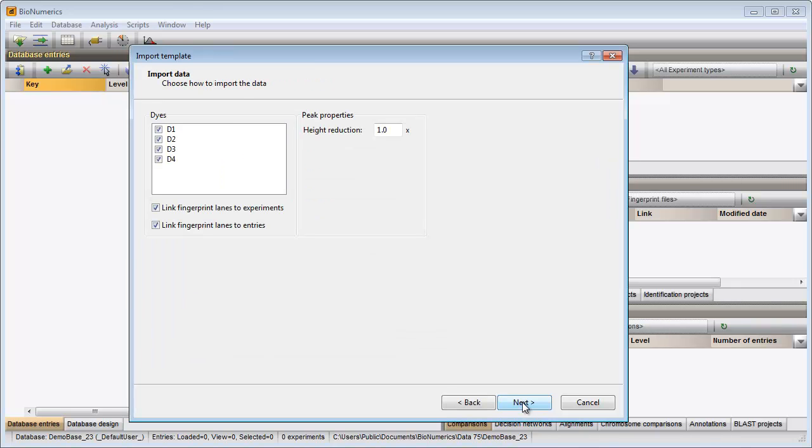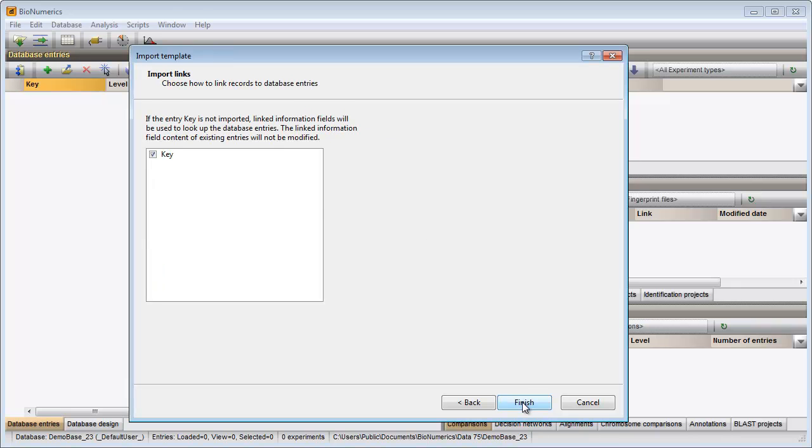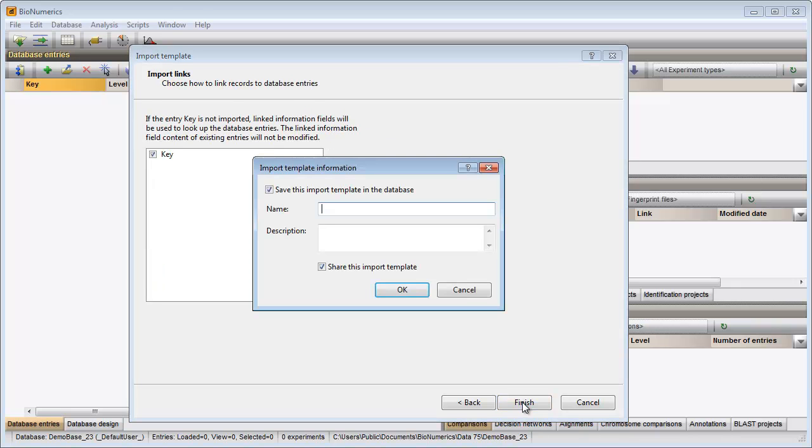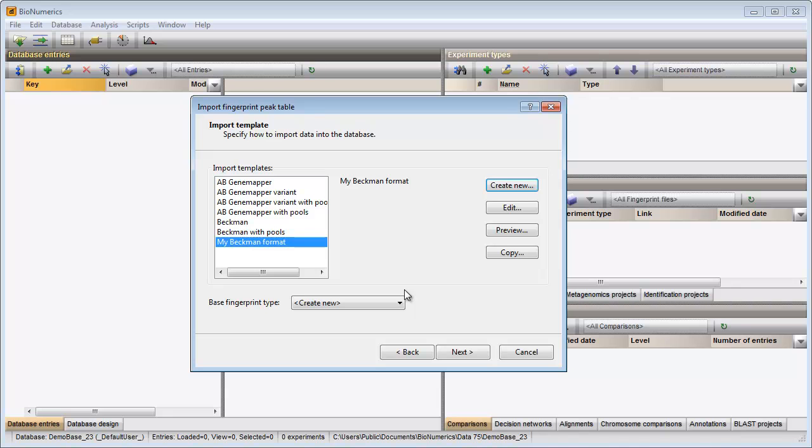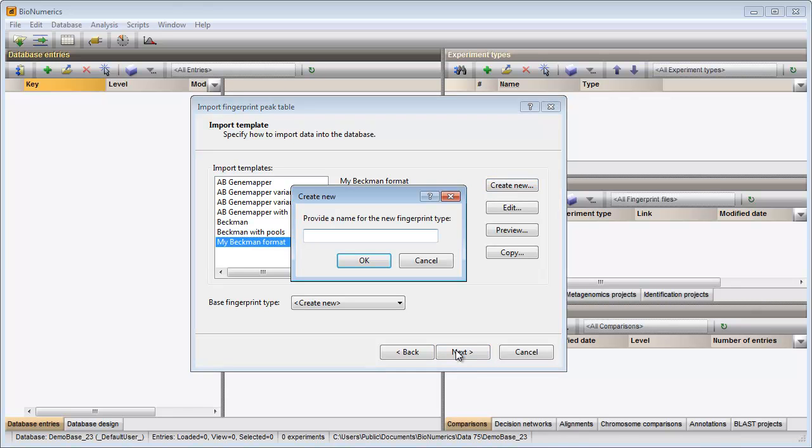I will import all dice in my database, and in the last step I need to specify a template name. My template is now added to the database. I make sure my template is selected and press next. A new base fingerprint type experiment will now be created. I specify a name and confirm the creation of the missing experiment in my database.